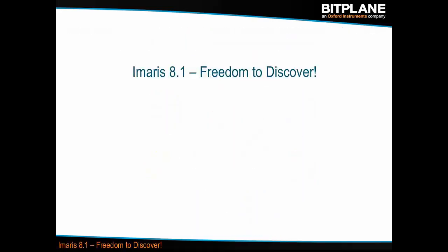So this brings us to Imaris 8.1. I mentioned it is a natural step, so it's not an enormous jump like it was from 7.7 to 8, but it offers three main things that will make your life easier.